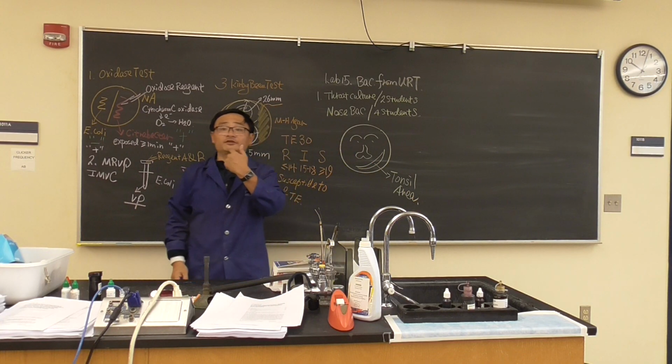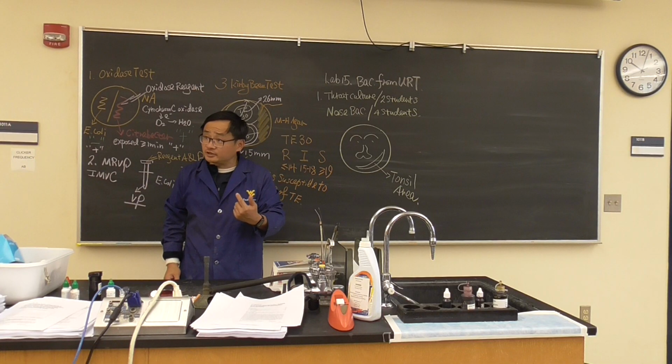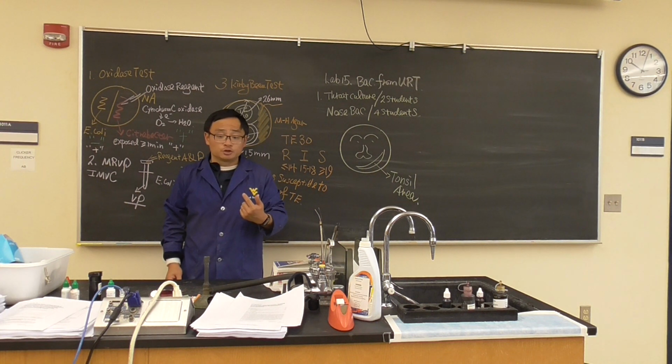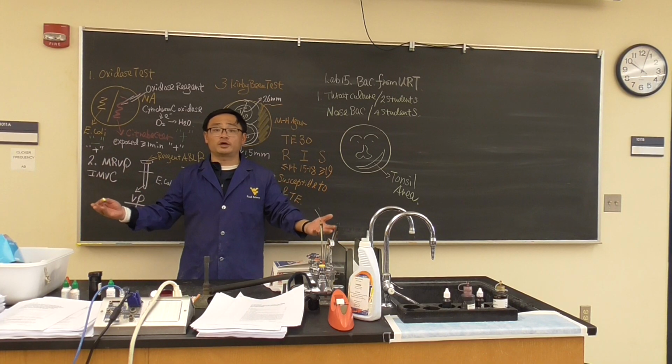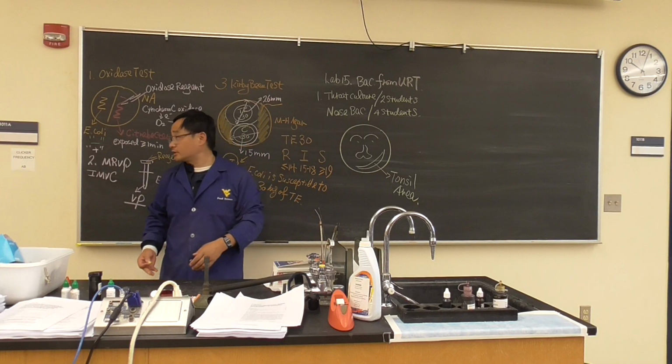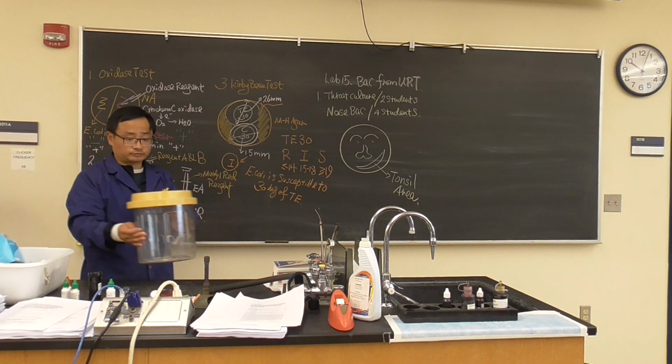not your oral cavity. Because if you get the oral cavity, what do you have? It's viridans streptococcus, which means no matter what you do, you get a bunch of junk streptococcus, and you don't know where they are. Okay, and they are horrible when they grow on the blood agar. Okay, that's good. We need multiple.